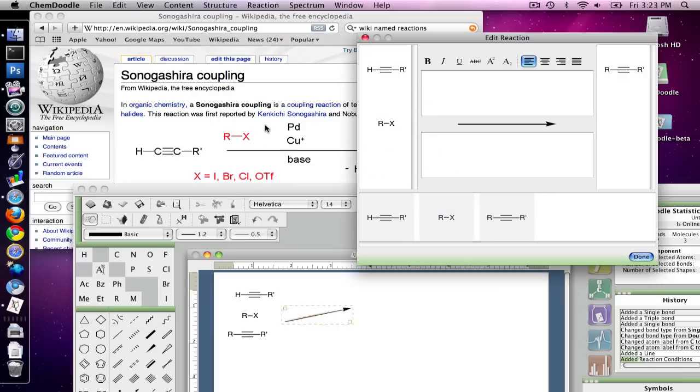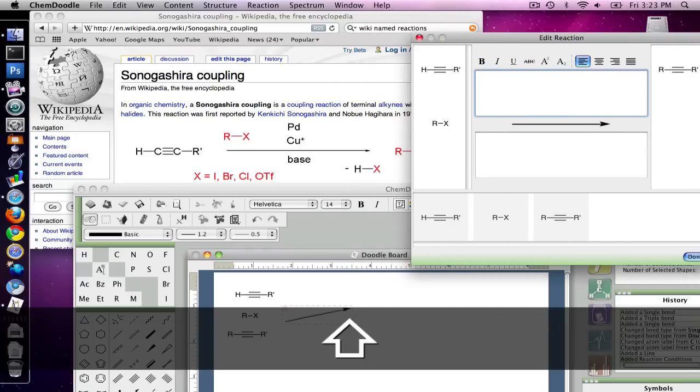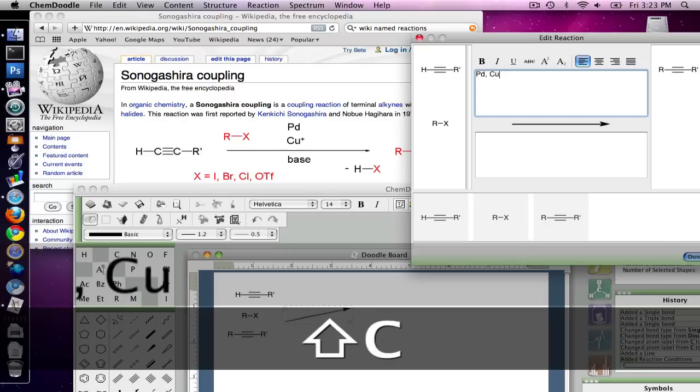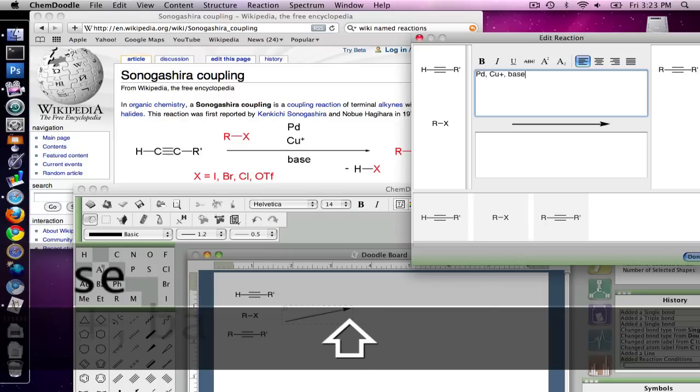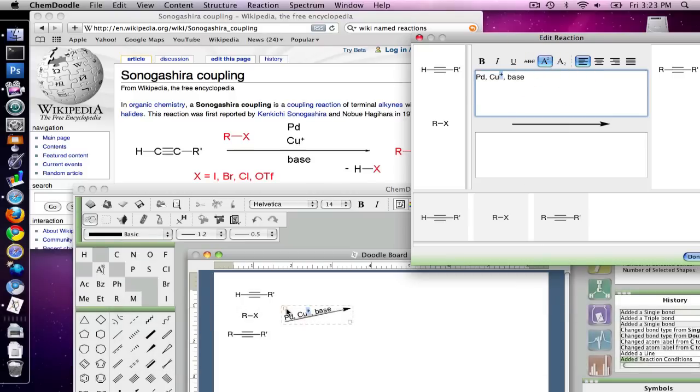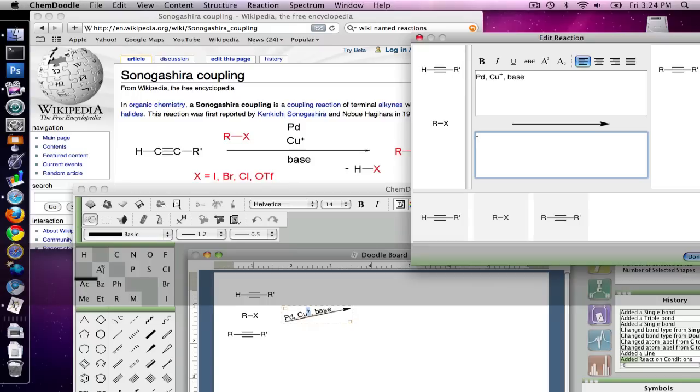So I also want to add the rest of the descriptors for the reaction here. And so at the top, I'm going to put in the palladium, the copper, and the base. You'll notice that they've already popped up down here. And on the bottom, I'm going to show off this hydrogen halide that will be being removed from the system.